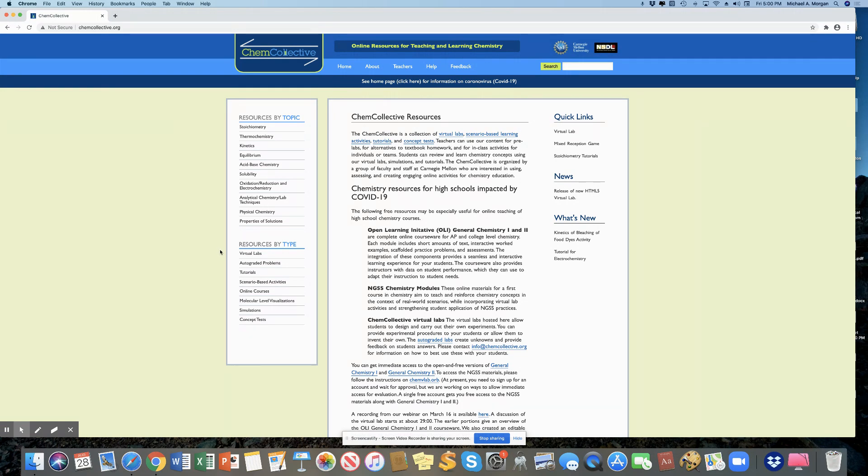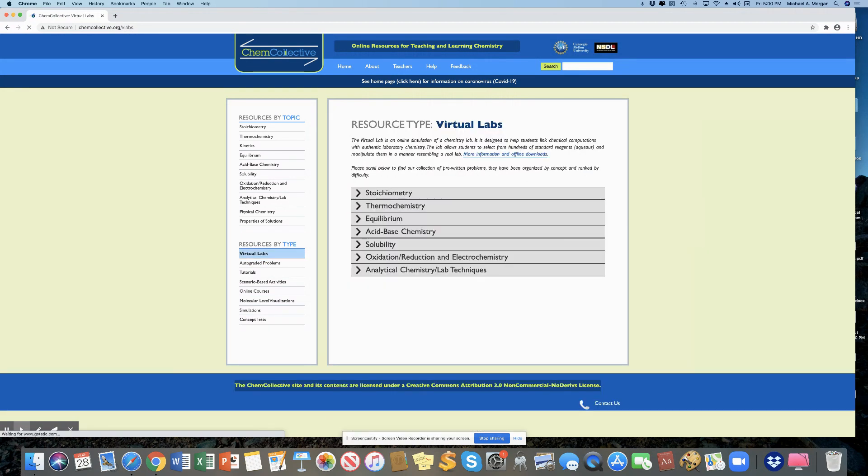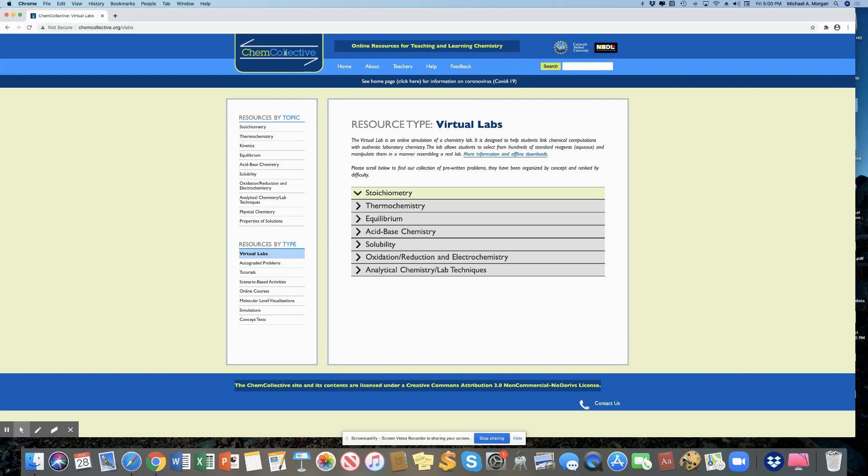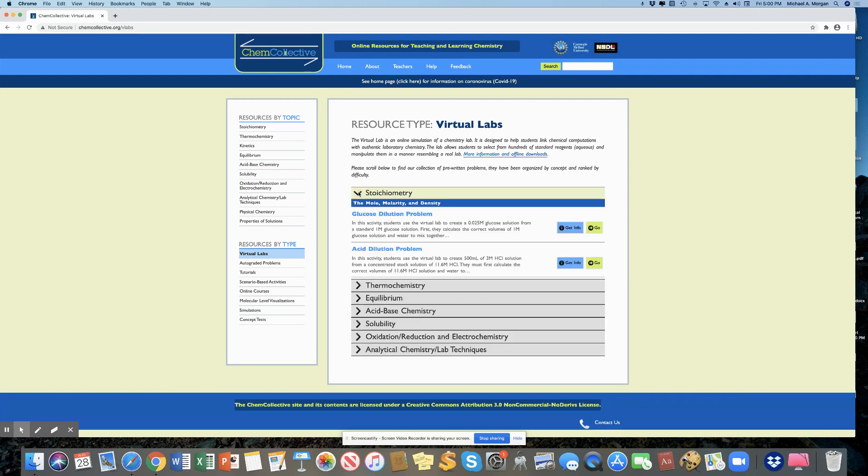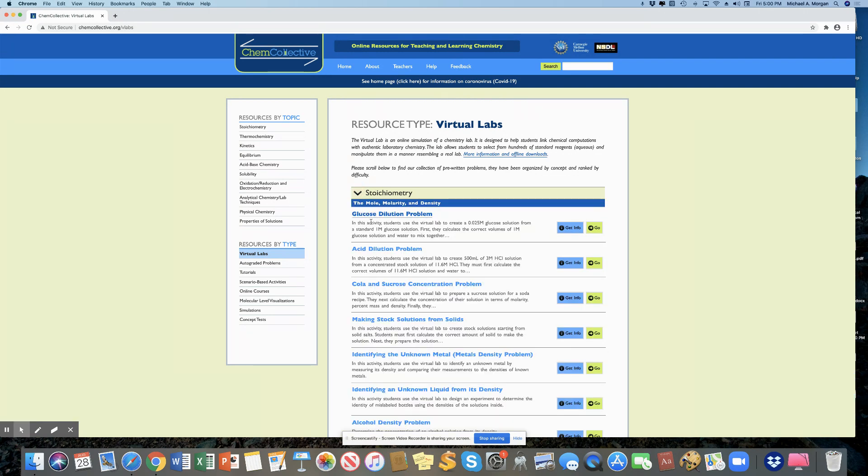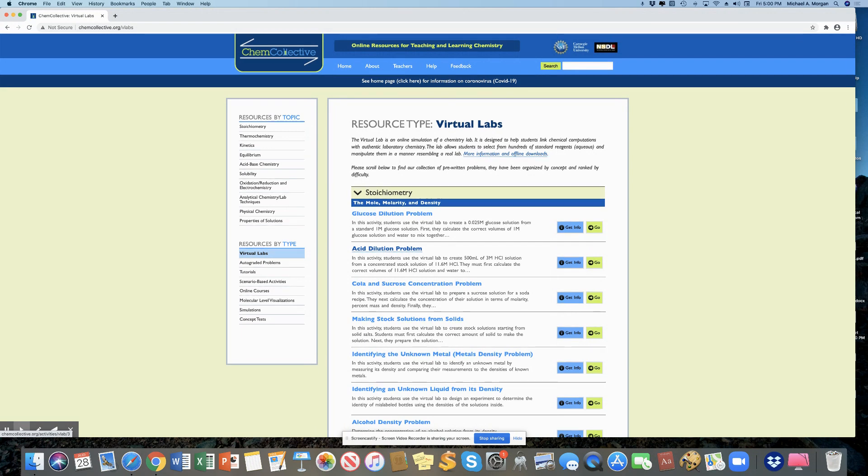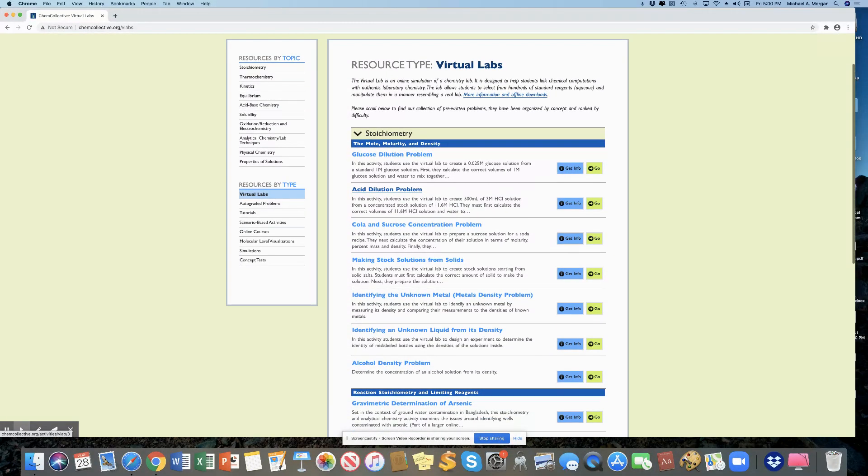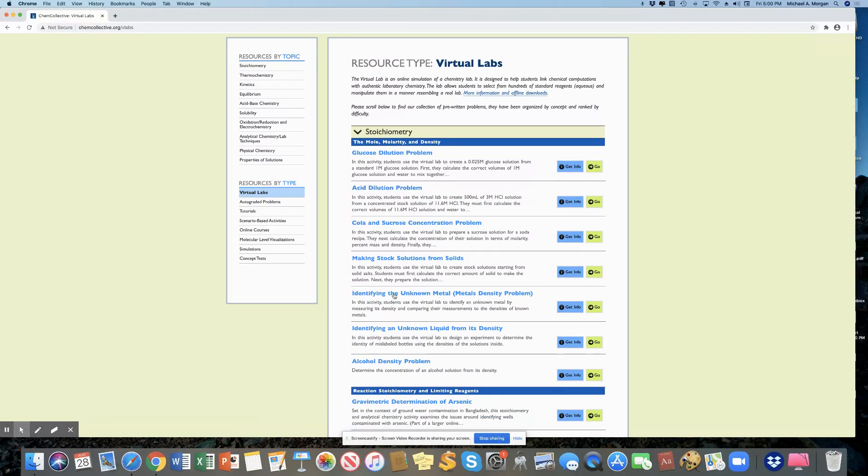Now when you get there, what you're going to do is you're going to choose virtual labs. And after you've chosen virtual labs, you're going to go to the first menu here called stoichiometry. And then you're going to come down just a few choices and identifying the unknown metal.